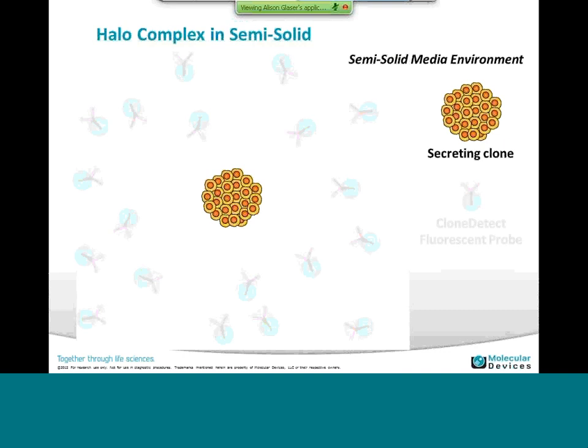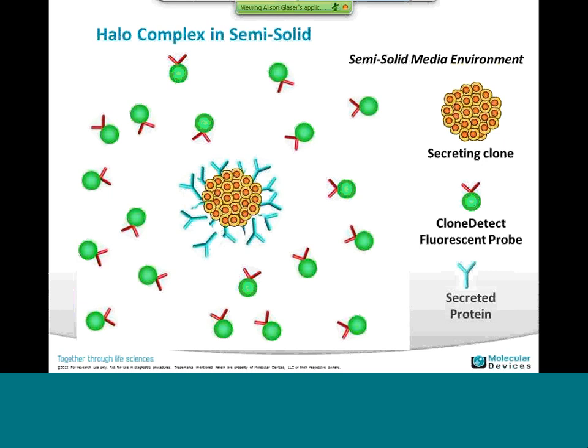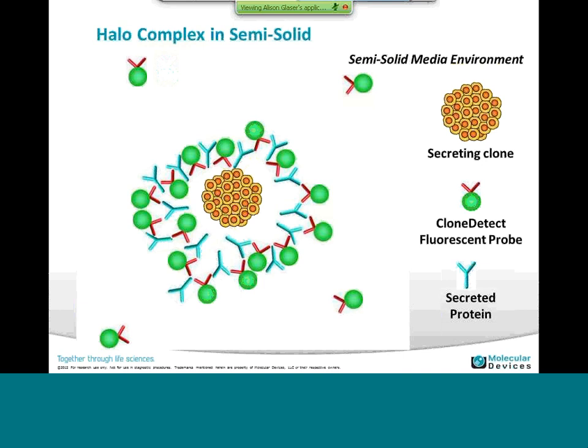Using a different animation here, this captures the same principle of secreted protein aggregating around the colony. With capture probe present in the medium, the secreted protein and the capture probe are mutually trapped locally around the colony of cells, producing a halo effect. The amount of fluorescent capture probe is proportional to the amount of protein secreted.